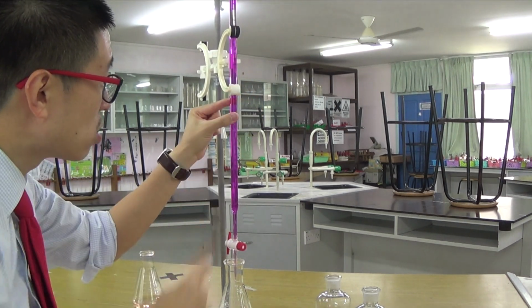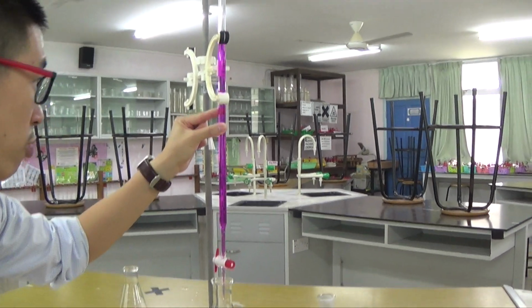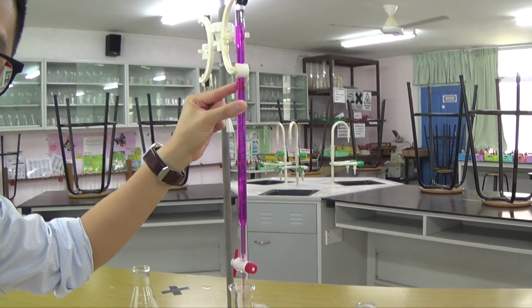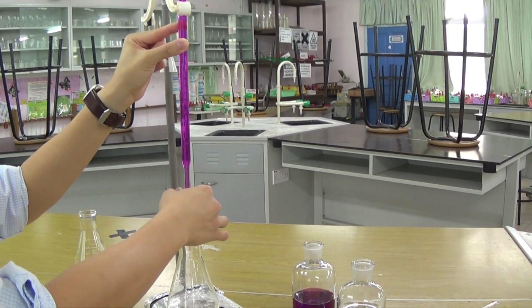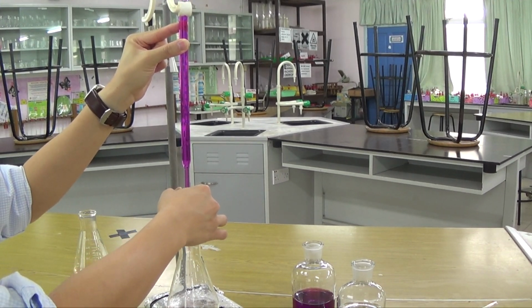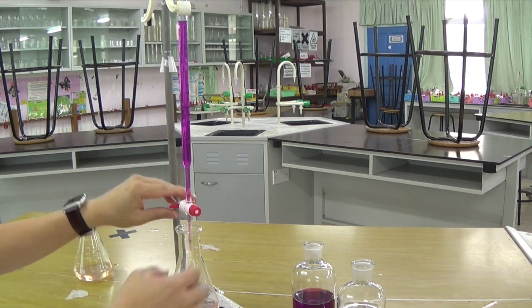So I'm not going to slow down, I will just let it flow full speed until it reaches 36, then I will slow down, okay? So when it reaches 36, then I will stop, okay? I'm not wasting time that way because I roughly know where I'm finishing already. So it reached 36 already, so now it's 36.